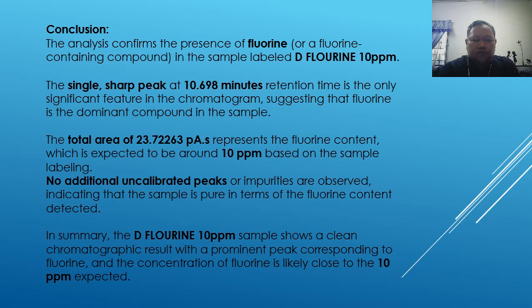The conclusion for defluorine 10 ppm: the analysis confirmed the presence of fluorine or a fluorine-containing compound in the sample labeled defluorine 10 ppm.